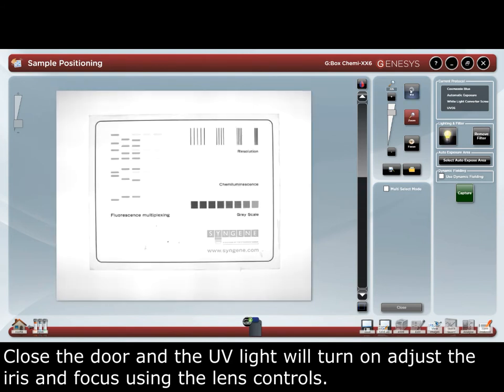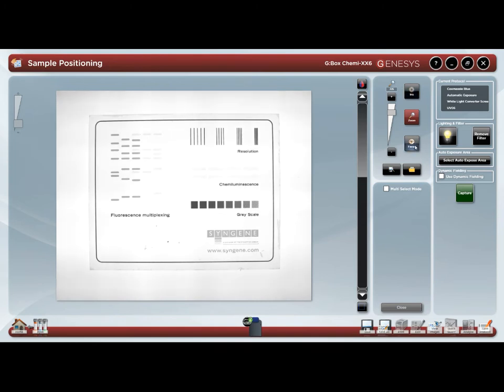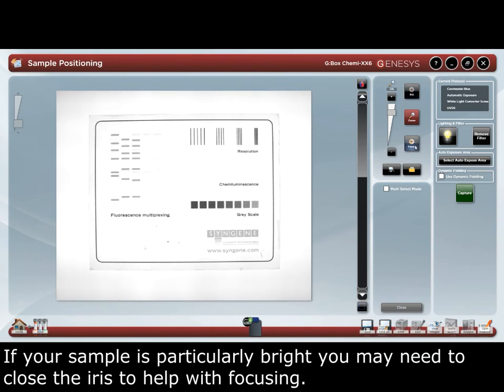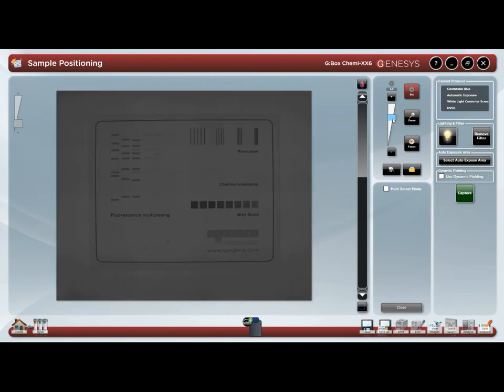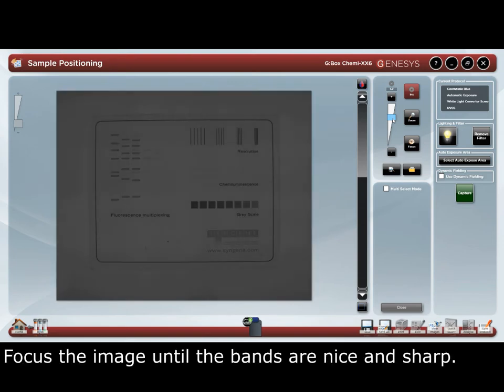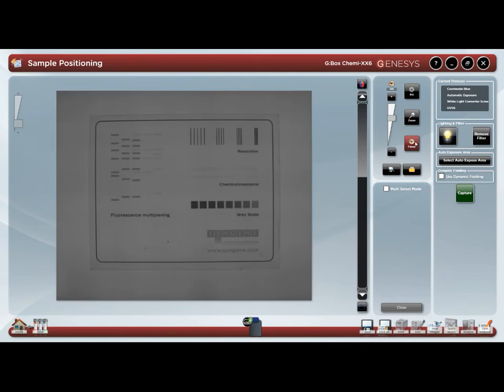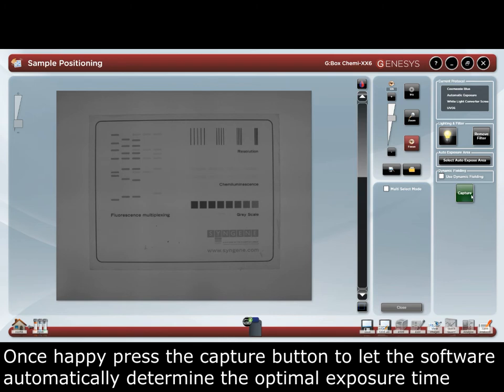Adjust the iris and the focus using the lens controls. If your sample is particularly bright, you may need to close the iris to help with focusing. Focus the image until the bands are nice and sharp. Once happy, press the capture button.